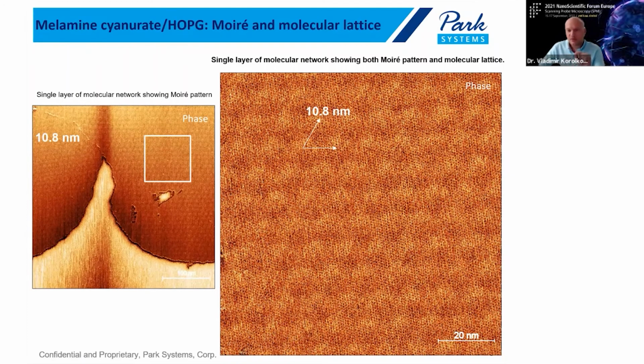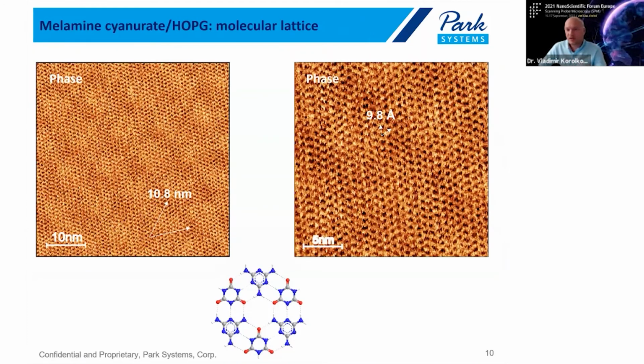And if we zoom a little bit further, that molecular lattice becomes really obvious, and we can measure it to be 9.8 angstroms. Again, that was performed using that higher eigenmode approach in air, and that type of resolution.